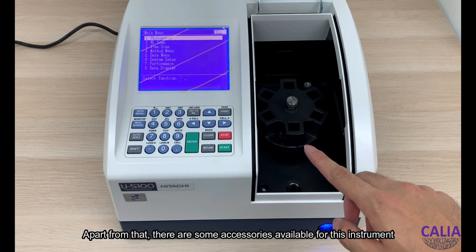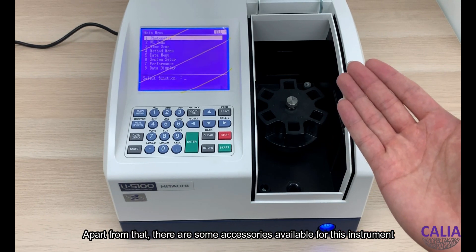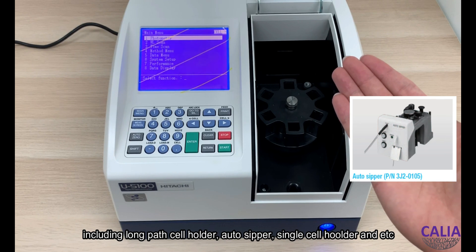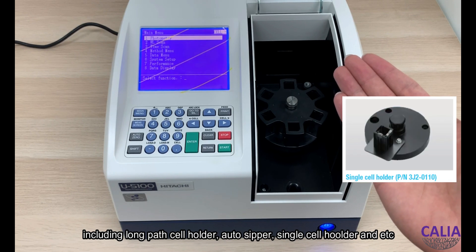Apart from that, there are some accessories available for this instrument, including a long-path cell holder, auto-sipper, single-cell holder, and more.